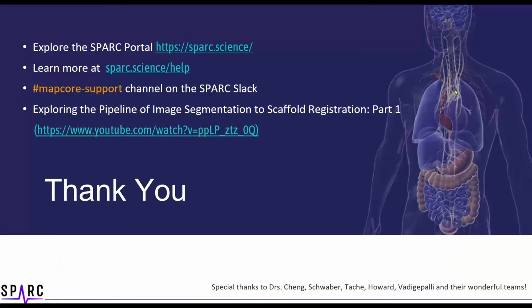We hope that you now have a much clearer picture of the steps involved in scaffold registration, and you are as excited as we are about the benefits and potential that scaffold registration can bring. We certainly look forward to registering more of your data onto the different scaffolds. So please feel free to get in touch with us through the MAP-Core support channel on Slack if you would like to have a chat about what we can do with your data. We would also like to take this opportunity to thank our collaborators again for allowing us to use their data for demonstration today, and thank you all for your attention.